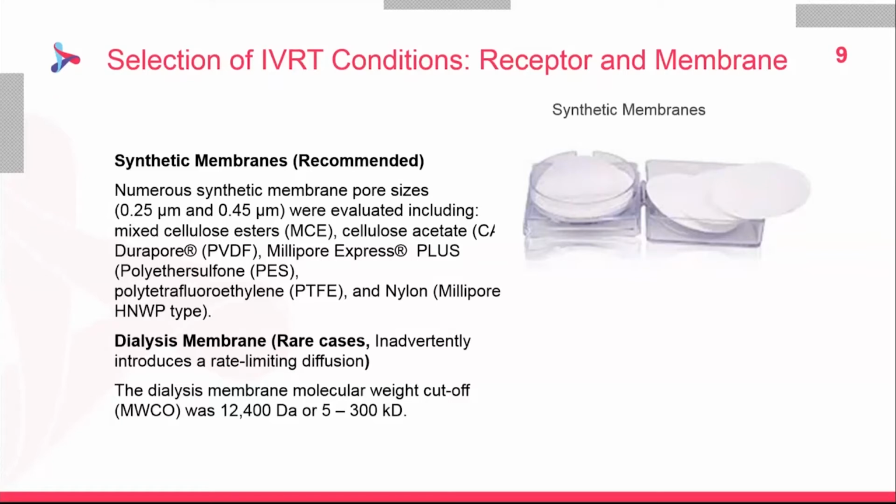The first step is visual examination, prior to soaking the membrane in the release medium for at least 30 minutes and before dosing. The membrane should not exhibit significant changes in appearance. The next step is to conduct the membrane binding test, normally with 3 replicates, as mentioned today, with the quality control standards, low and high quality control replicates.